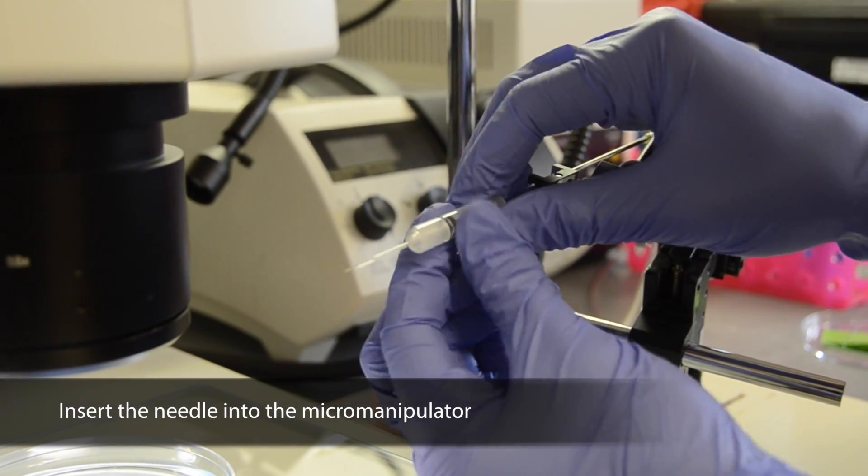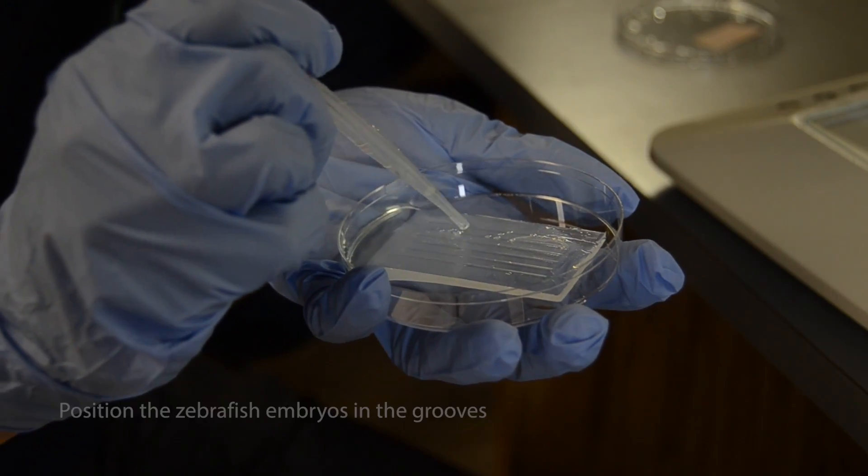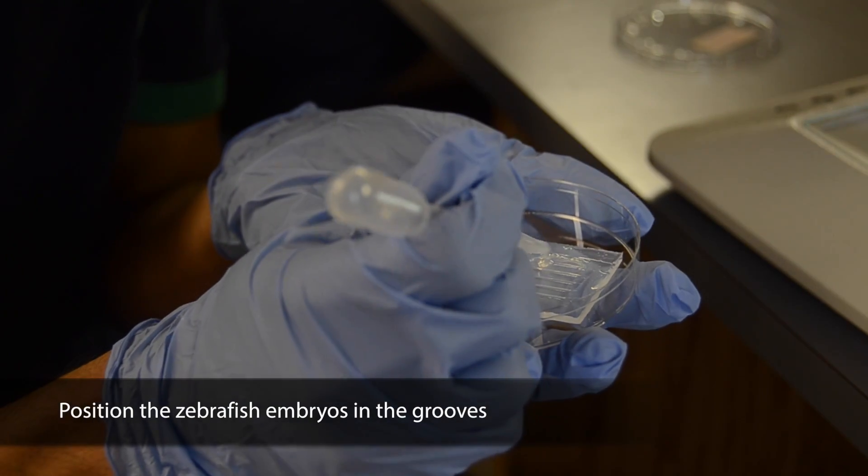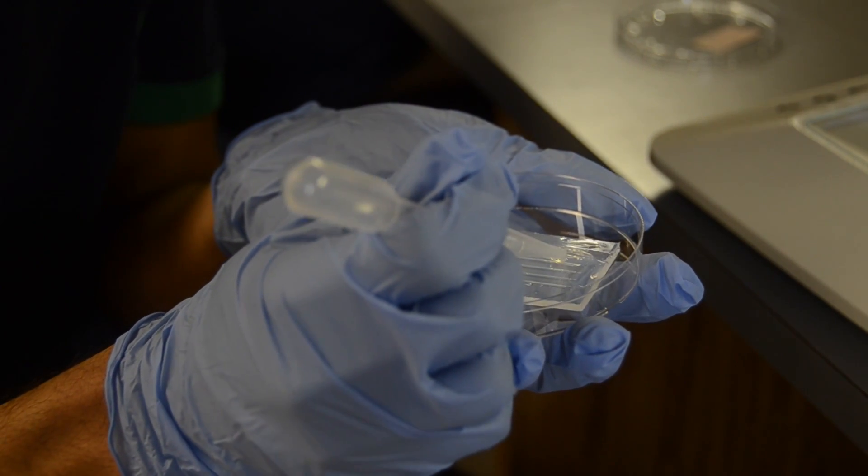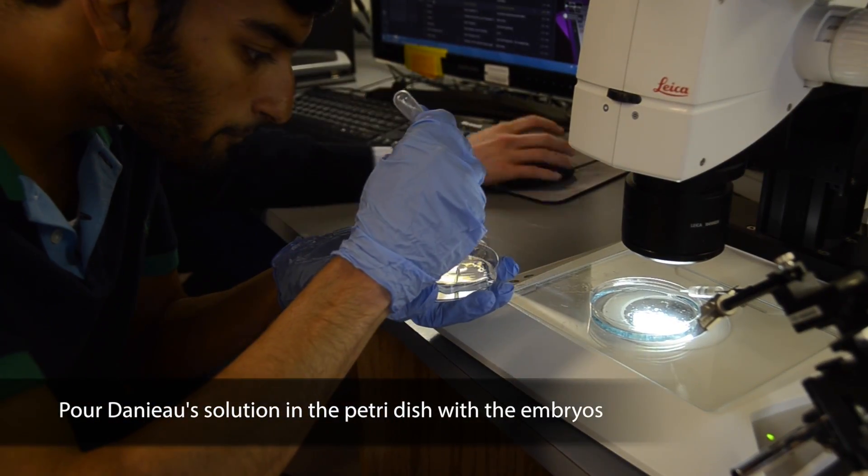Insert the needle into the micromanipulator and set the system. Place zebrafish embryos in a piece of agar that has grooves in it. Position the embryos in the grooves. This will stabilize the embryos when you are injecting. Pour Daniao solution in the petri dish with the agar and the embryos.